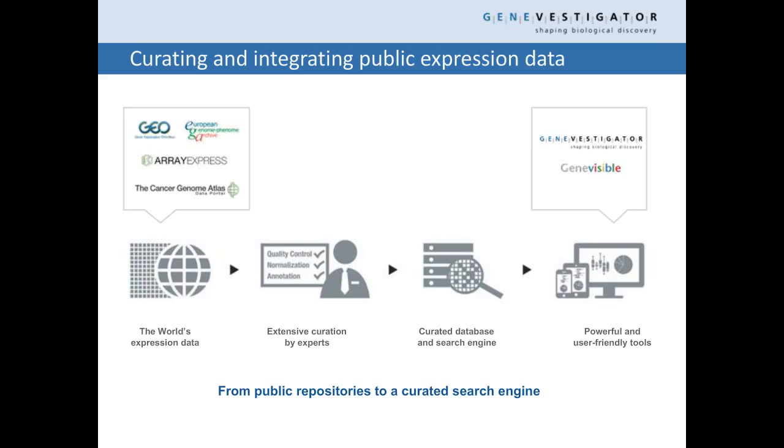And so we have a team of curators who work on collecting these experiments, on integrating them into the database, curating all the annotations, which means all the descriptions of all of these samples, and then we bring it all together into a database where everything is completely systematically annotated, described, but also quality controlled and normalized in a way that we can compare between experiments.